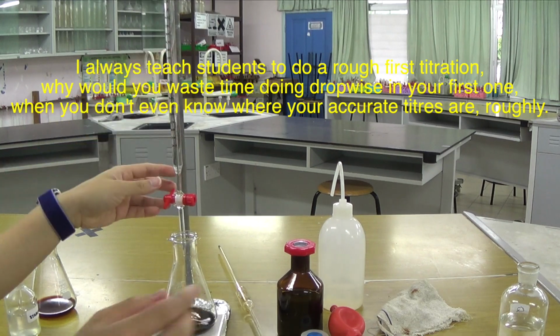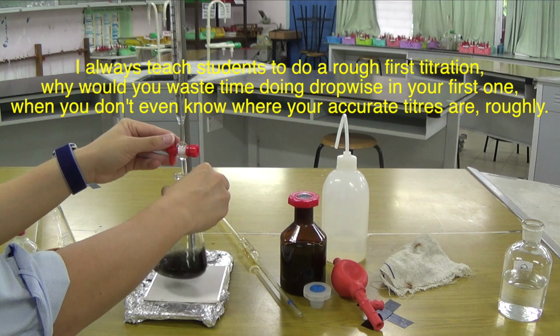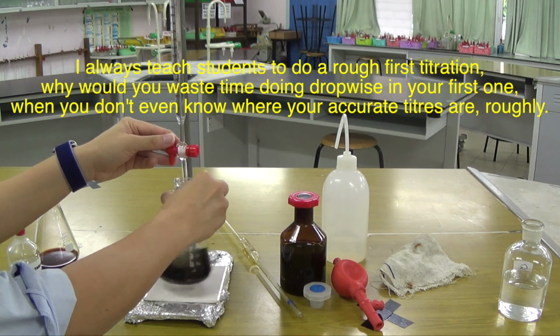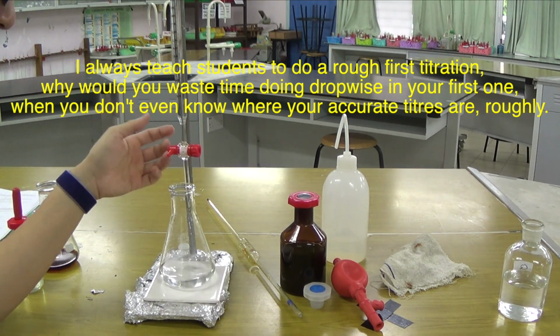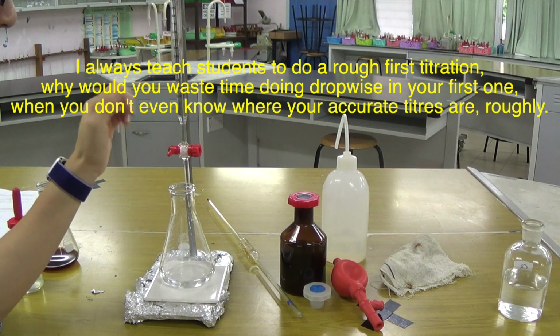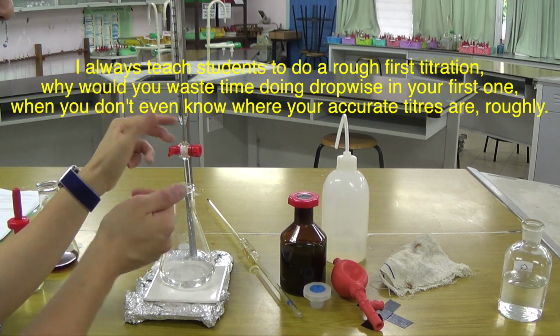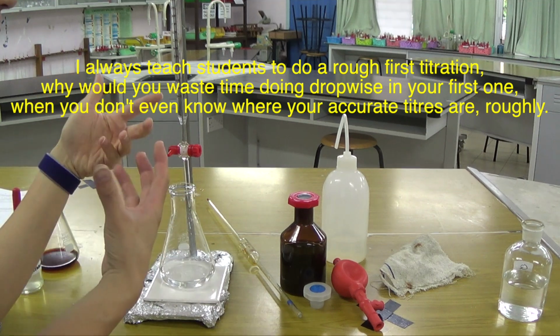Alright, so let's see what happened here. With my hand on the tap, I don't care where I stop. I open it full speed, and then when it turns colorless, I stop. This by far is not an accurate titration because I did not do it drop by drop. If you want accurate, you have to do it drop by drop. I was going all the way, and as soon as it changed, I stopped. This is called a rough titration.